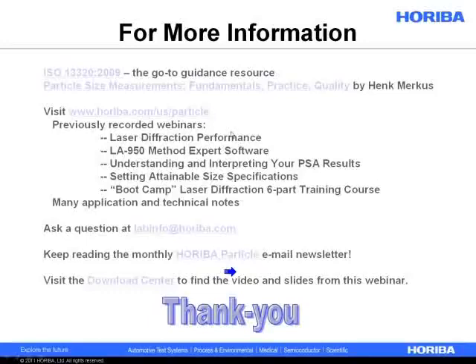Jagdish also asks how we determined the 0.05 weight percent concentration in the CMP slurry. Just as you normally would. You get your little mass balance out. We have a nice analytical mass balance in our applications lab that's accurate to 5 decimal places. You just get it out, you weigh it, you're very careful about how you add it into the analyzer.